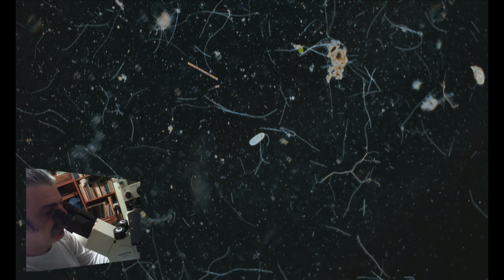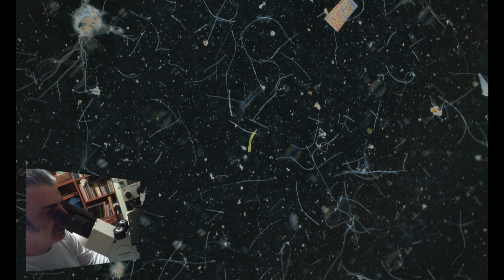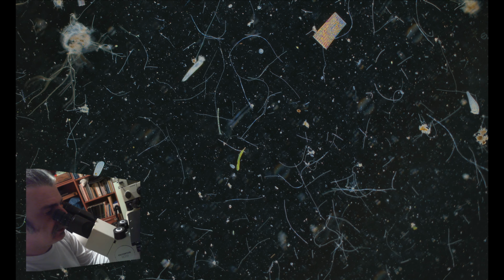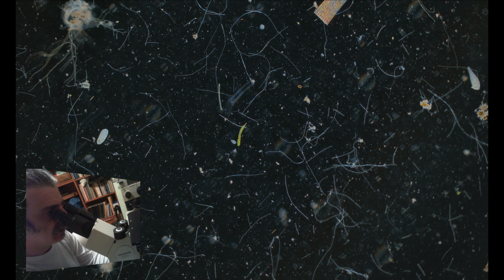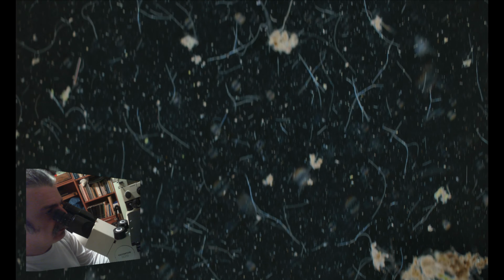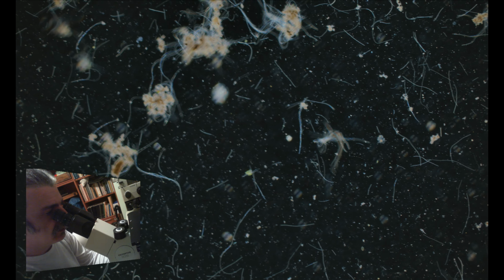Here's another ciliate, probably a frontonia, we'll see it later. We can see this green bar in the middle, it's a euglenid. Again, we'll see all those creatures in detail very soon.